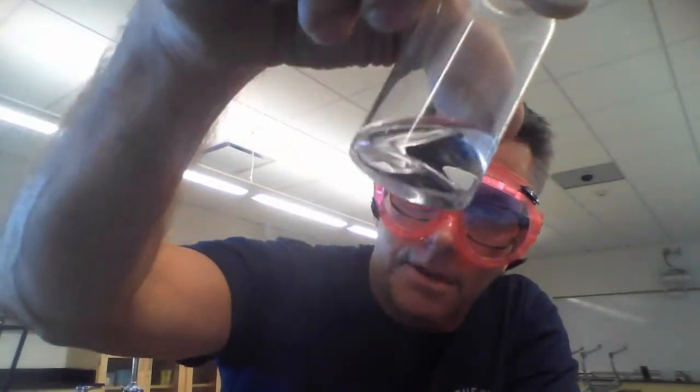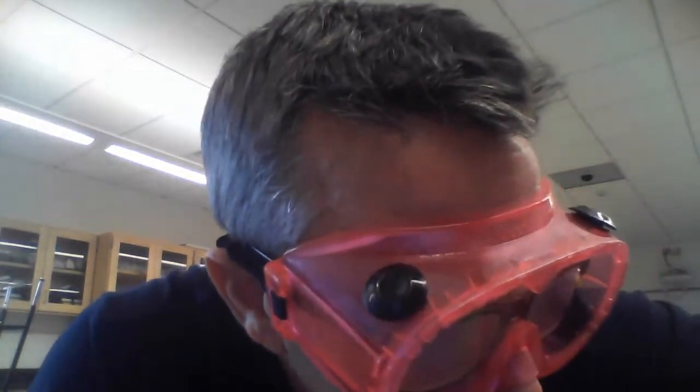I would say it has a sharp odor, and it reminds me of rubbing alcohol if you've smelled that before. This is called N-propanol, another clear, colorless liquid. I'm not going to really focus on that too much here. Oh, there it is. Similar, sharp. It smells like rubbing alcohol to me.